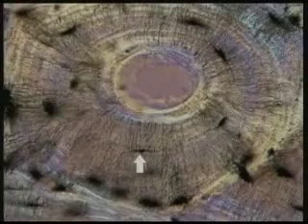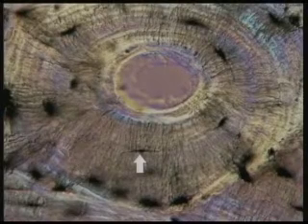It endows the cell with this shape, which is somewhat like a goblet, hence the name. And just keep this cell shape and function in mind when we look at some of the other cells as we go through a series of images. The next cell we're going to consider is the osteocyte.